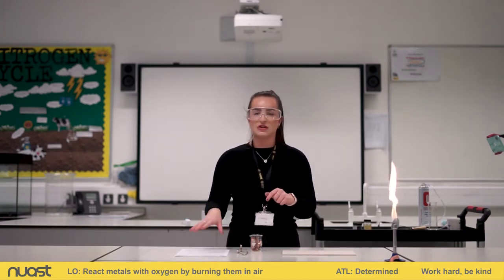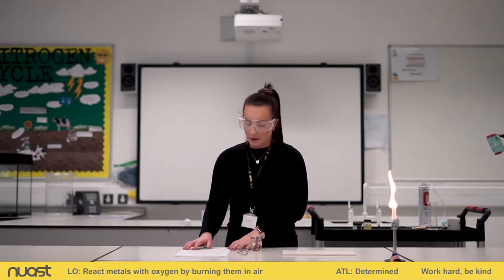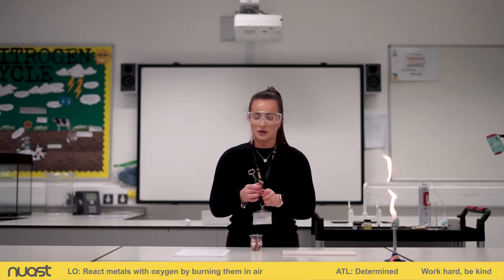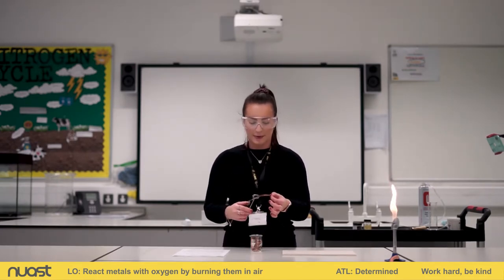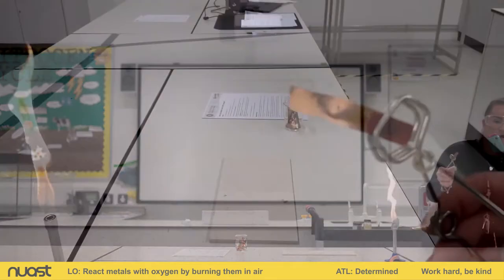On my teacher's notes, which weren't actually on your worksheet, I've got exactly the method to follow. It says, when reacting copper with oxygen, hold a piece of copper into the Bunsen burner using tongs. So here I have my tongs and I've got my piece of copper. I'm going to bring that up to the camera so you can see what it looks like before.